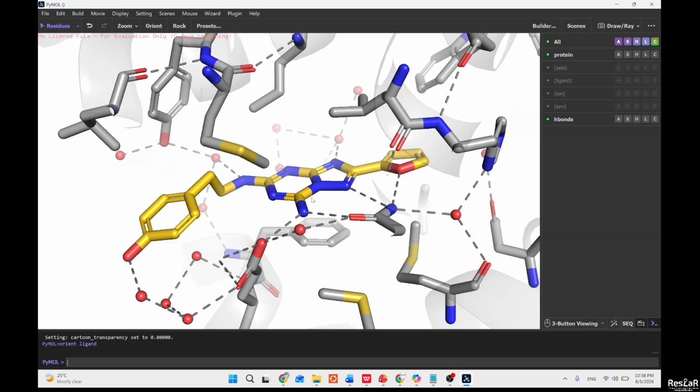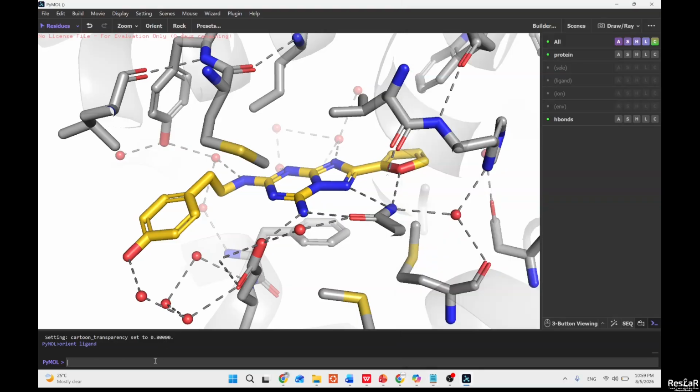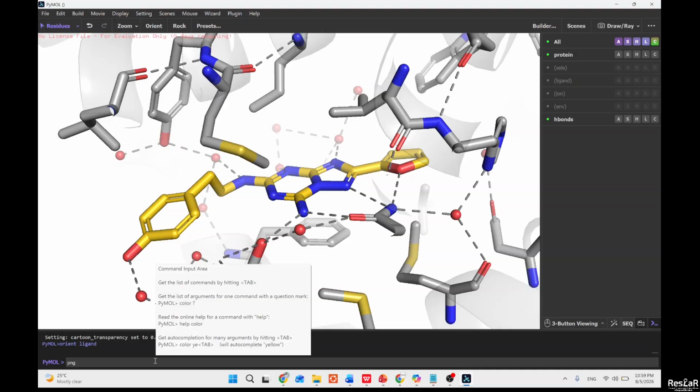And then once we are done, we can save it out. We can save this out by running PNG. We'll give it a name.